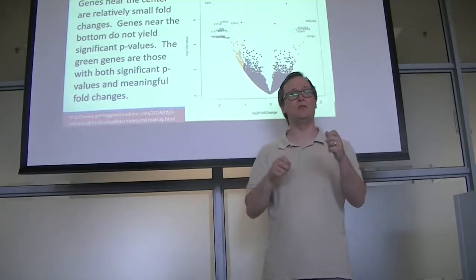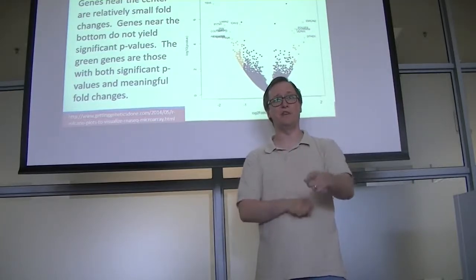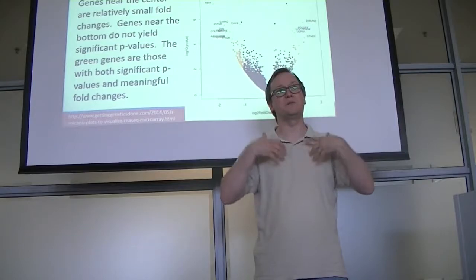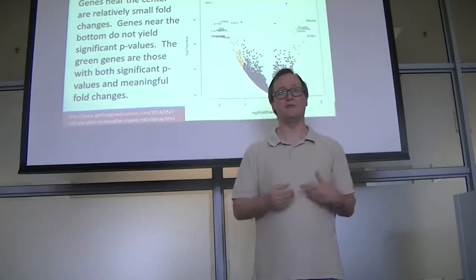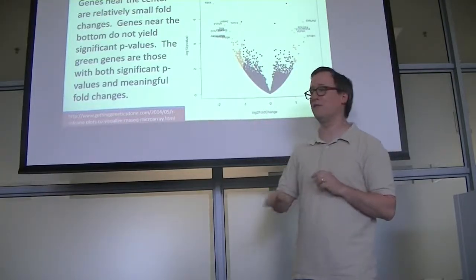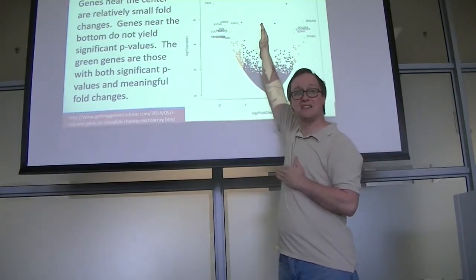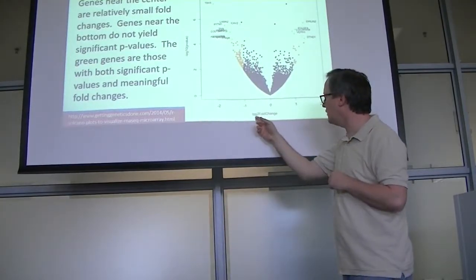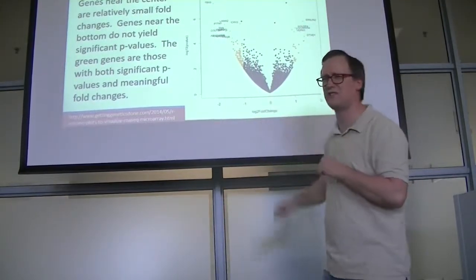So we want to know not only that the gene is differential and thus high, but to express the direction of that difference. So in effect, what we have is an axis sitting right here at log fold change 0. So log base 2 of fold change equal to 0. What does that mean?